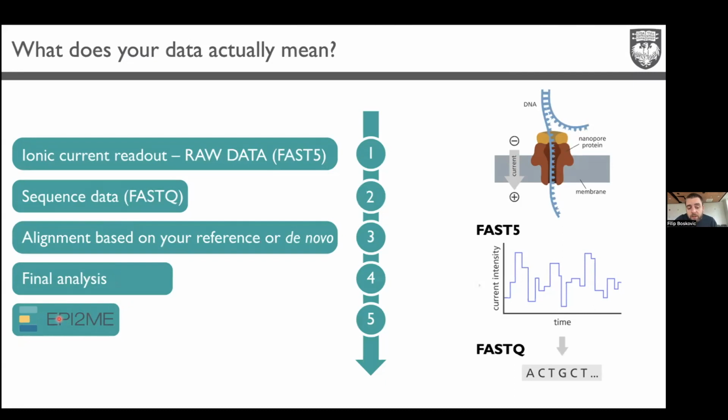Therefore, for bioinformatics, if you don't have any experience, don't worry, because they have this Epi2Me software. It's basically just like PowerPoint, for example, that you just install. It's free once you have an account. And then you can have a prepared workflow. So it tells you, oh, do you want to do plasmid sequencing? Oh, upload me a FASTQ file. So you choose your FASTQ file from your sequencing results, and you just press run, and you get output, a FASTA file of your plasmid. It's simple as that. So you don't really need to think about how I should assemble it, what software I should use, or whether I have a script for it, and so on.